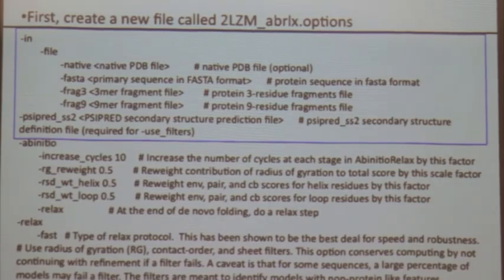This is the same as -in:file. Just as long as you're consistent in your options file. Just don't mix up these things. Don't mix tabs and spaces. Don't specify your home directory as a tilde. Because Rosetta can't really parse that. So you should say, instead of that, you should say /home/username. Because Rosetta can't parse that. So those are just some things to keep in mind when you're making your options.